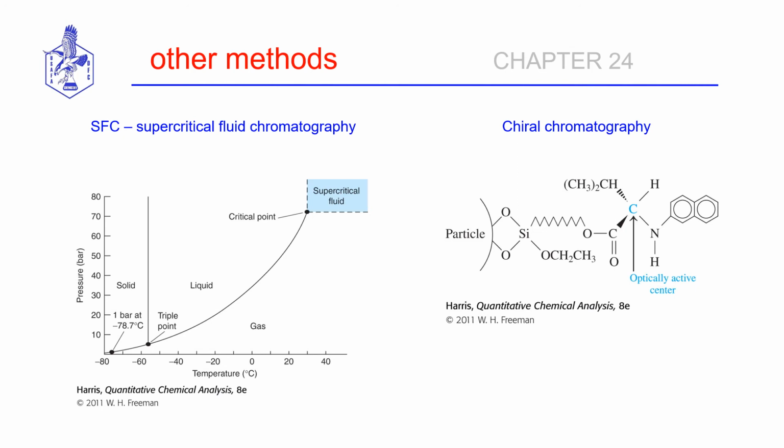To complete our consideration of all possible options available to us, I just wanted to bring to your attention there are some other chromatographic methods at your disposal. So supercritical fluid chromatography, SFC as it is known, how it differs from the methods we've considered thus far. If you'll remember a phase diagram of any particular solvent, okay, you have the triple point where all three phases exist at the same time.